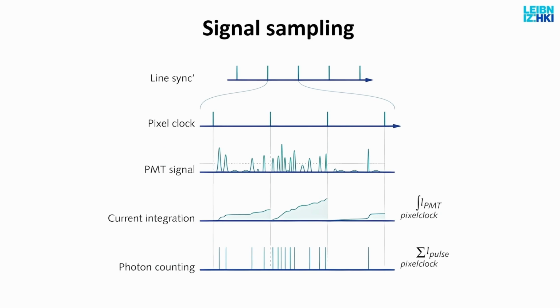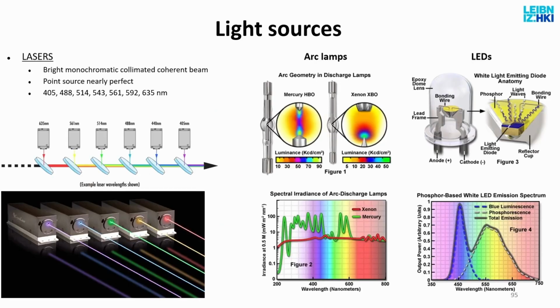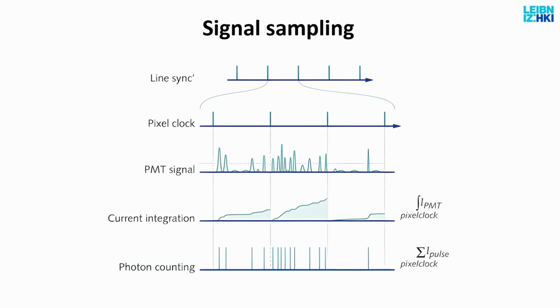If I say cut the pixel size in half, that means it will collect for half as long, then I will get this much signal here, this much signal there. So now I have two pixels, I will see the difference. This pixel will be brighter than that one. But at this current setting, this will be one pixel and it will be this bright. It's all up to you to set this up.